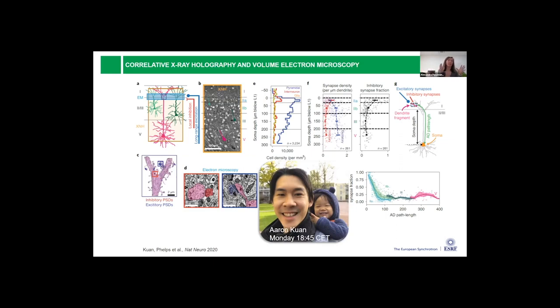So you can combine X-ray microscopy in 3D with volume electron microscopy in order to more quickly cover more volume and trace the dendrites. For now, we don't really see the synapses, or not enough of them. But then you can target and study synapses in specific regions. And if you want to know more about this, I invite you to follow the talk of Aaron tomorrow evening.